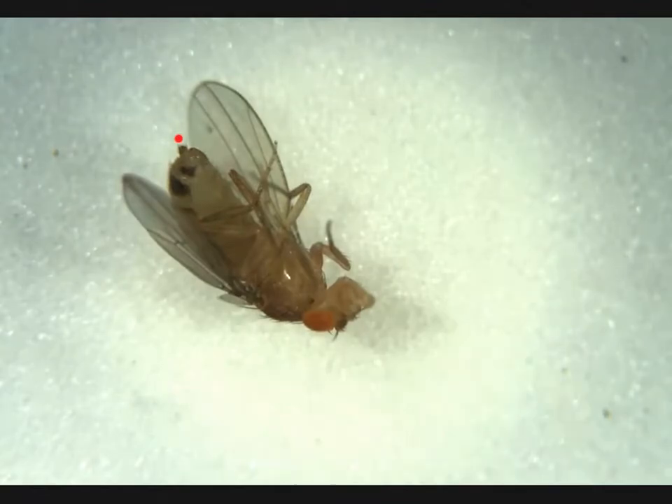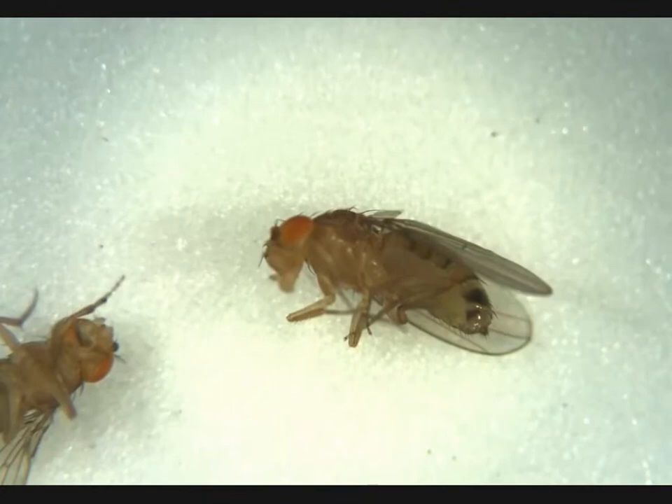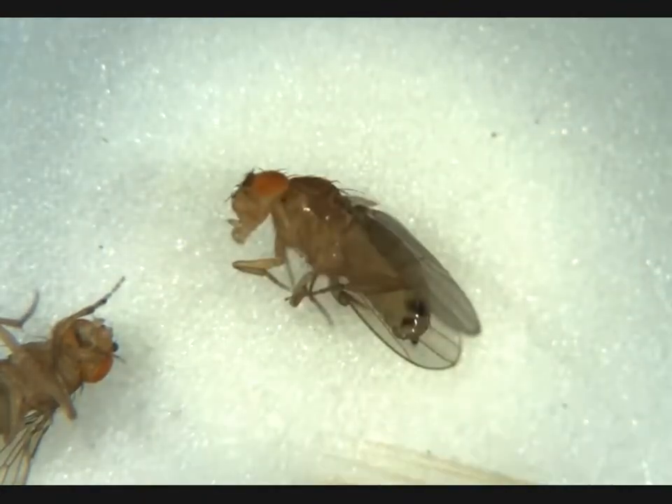We see we have a female here. No penis apparatus, no meconium, so she's adult. This right here is another female. No penis apparatus, no visible meconium — adult female.